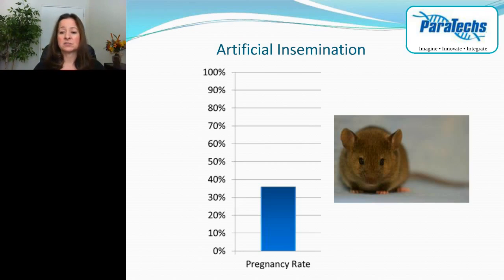If you're new to this procedure, I would suggest definitely practicing a few times without embryos, because embryos are precious, and getting the hang of working with maybe euthanized mice first. I don't think that the anesthetized mice are really necessary unless you're really uncomfortable with it.